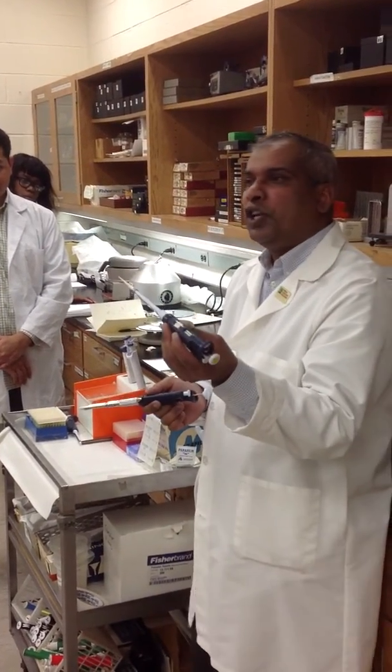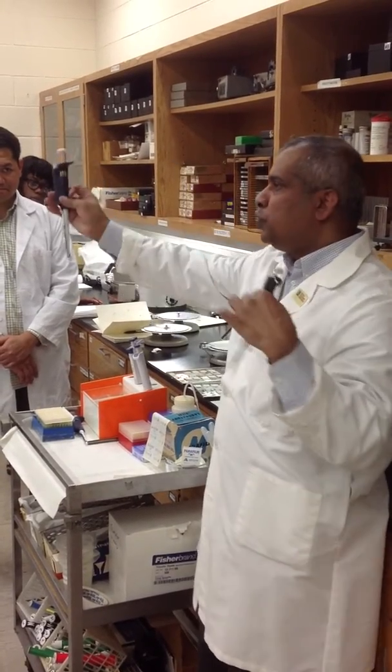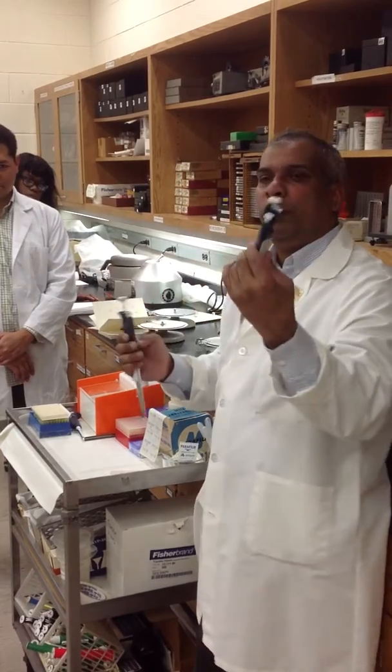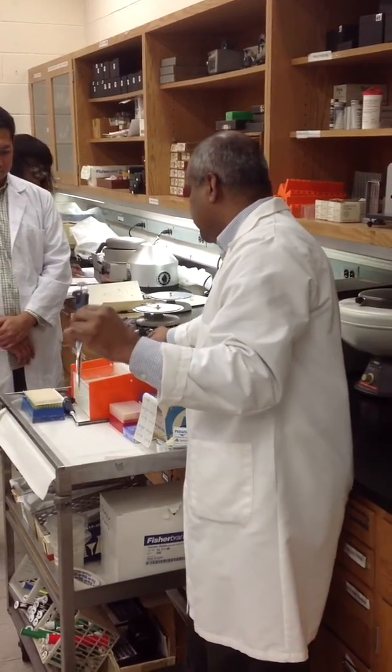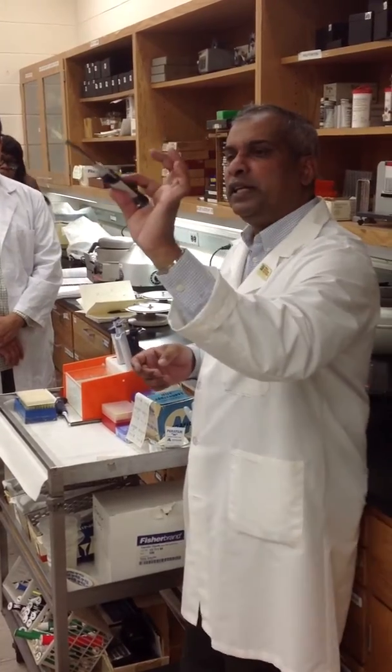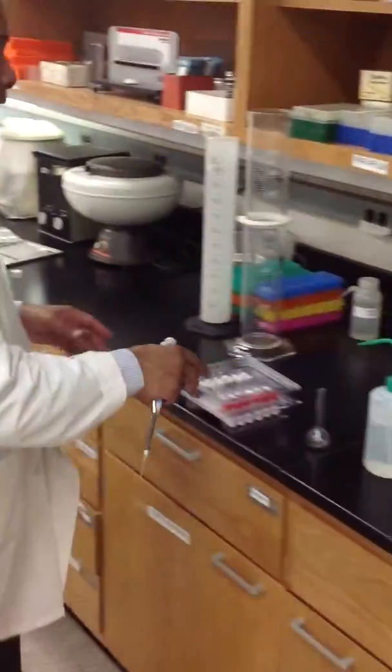So I need 125 microliters. Which one should I use? The 200 or the 1,000? 200. Use the one that's closest to your volume. That will be more accurate, right? And of course, there are different tips that it comes with, and it has an ejector here. And so you put your tip on.